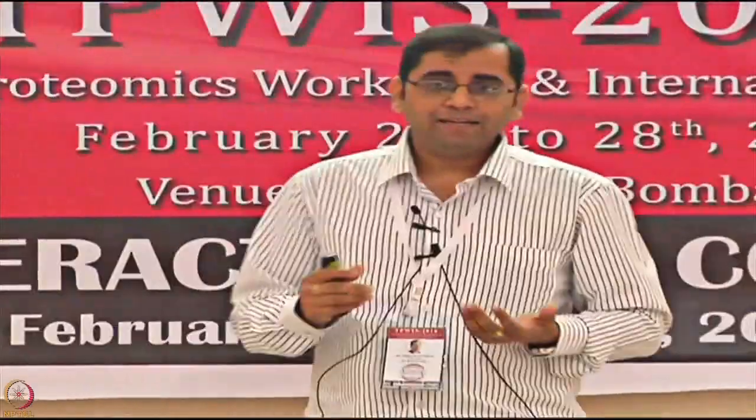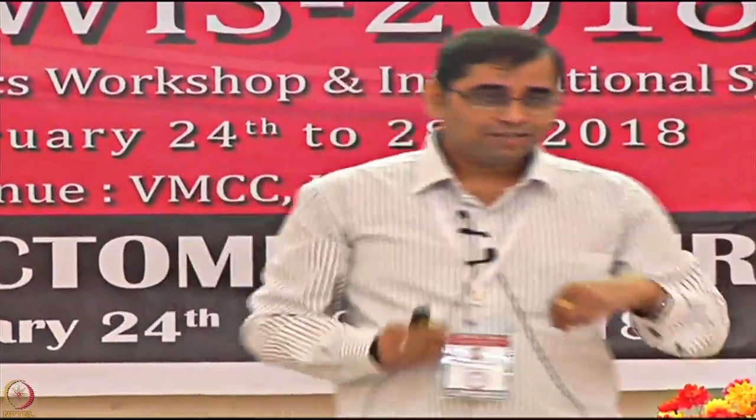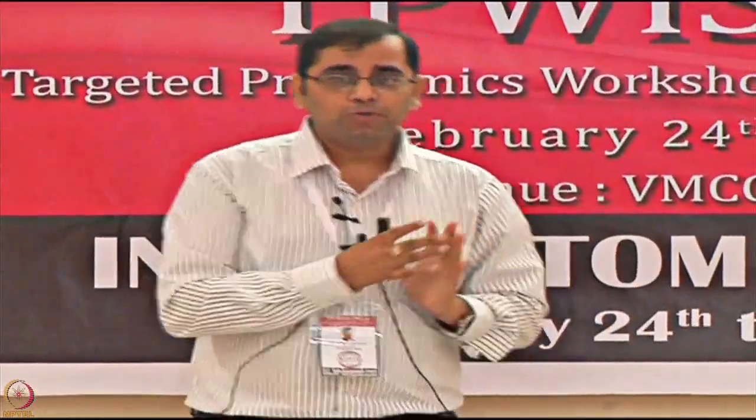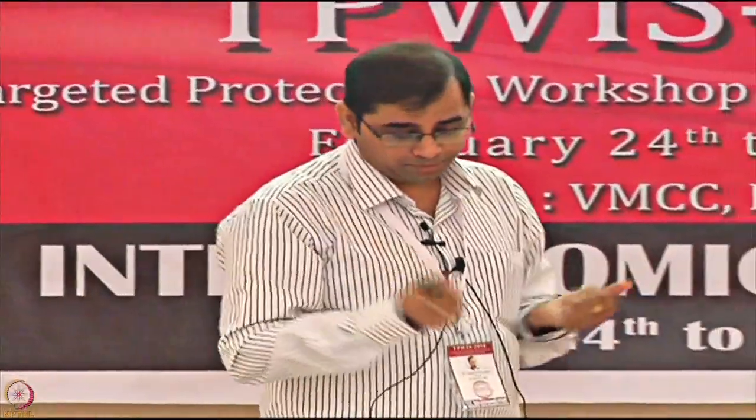In this case, if binding is not working, you will watch for just 20 minutes, stop it, and now you will bring a new solution, change the concentration, change the temperature, do different pH scouting. So you have many ways of planning to modulate the experiment. You are not just going to wait 10 hours for something to happen, and then say okay, it has happened or not happened.